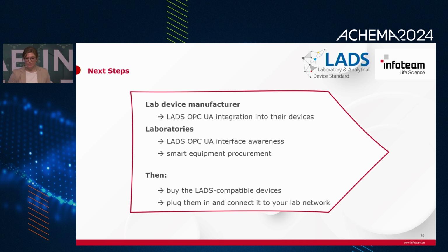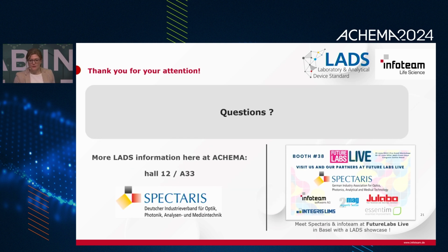And the laboratories need to be aware of the LADS interface, so they can plan and purchase new equipment with LADS. And then you can just buy the devices which are LADS compatible, and plug them in and connect them to your lab network. So with that, I would like to thank you for your attention. If you have questions, you can ask me now, or if you have questions later, you can also go over there to the Spectaris booth and also meet us at Future Labs Live in 2 weeks in Basel.